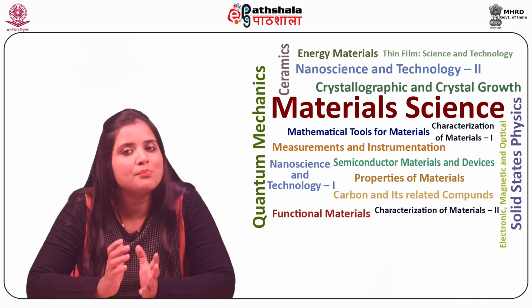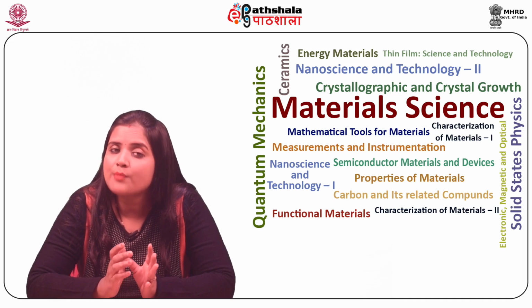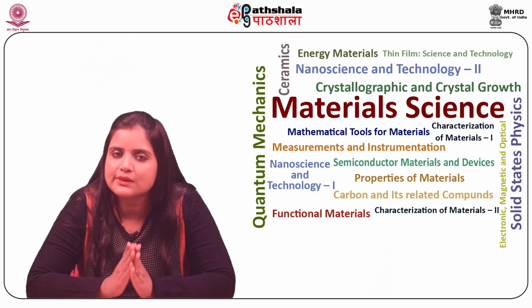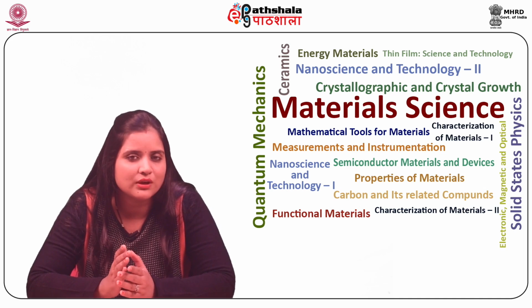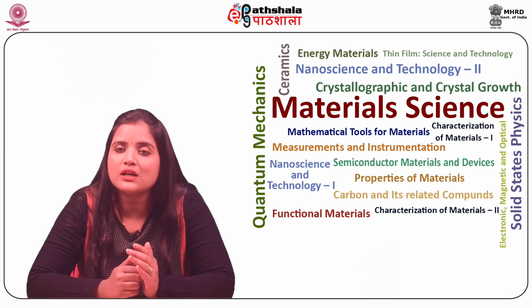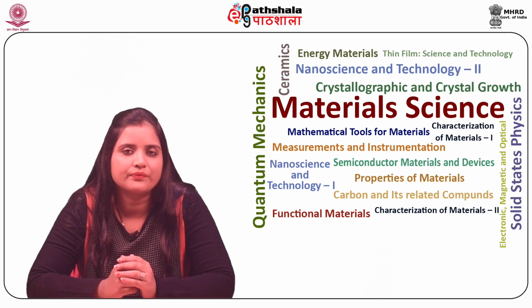DHM has been employed to study smart surfaces, self-healing surfaces, non-equilibrium systems, evaporation phenomena, electrodeposition, crystallization, mechanical deformation, etc.